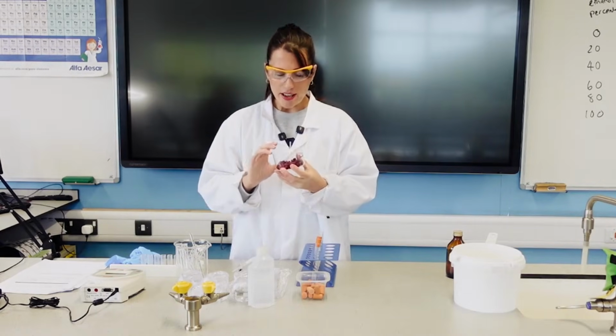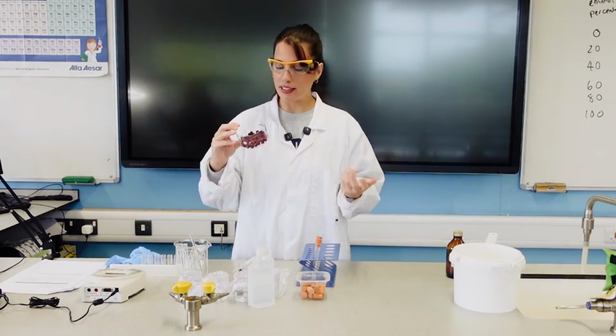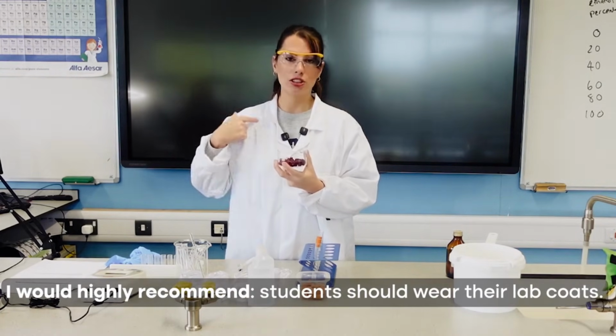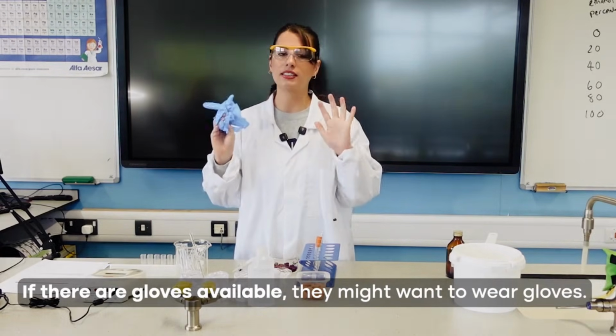Now, the last thing to point out, this isn't a risk, but obviously we are looking at the stain, the pigment, the betalain pigment inside of beetroot. It does stain, so I would highly recommend students should be wearing their lab coats, and if there are gloves available, they might want to wear gloves so they don't stain their skin.